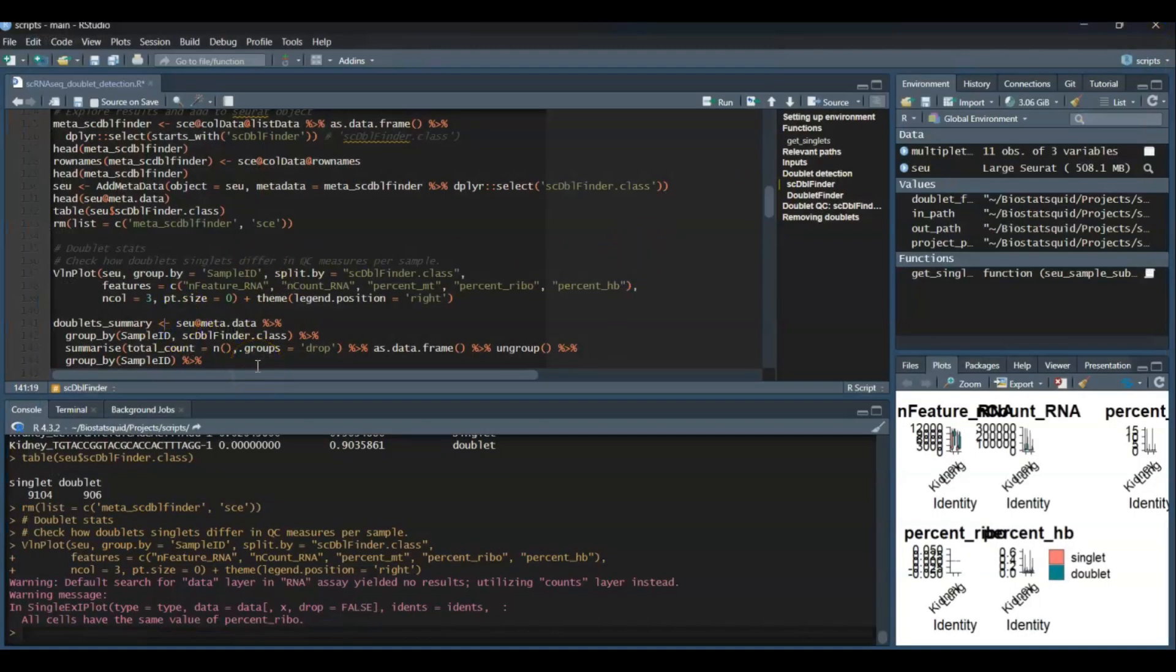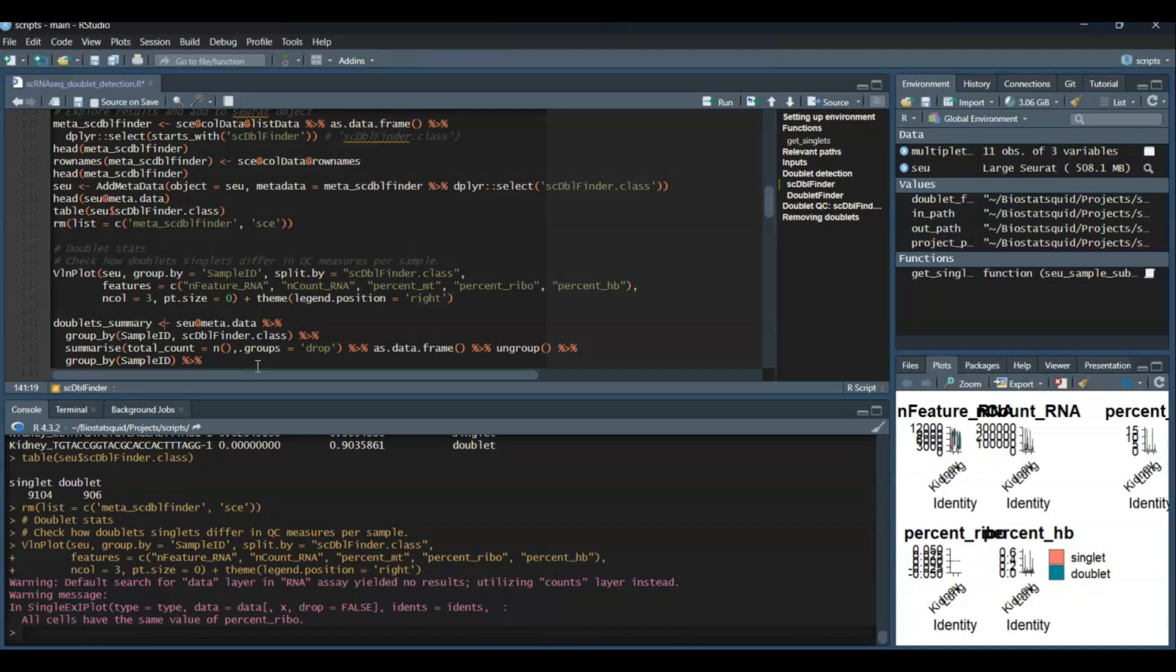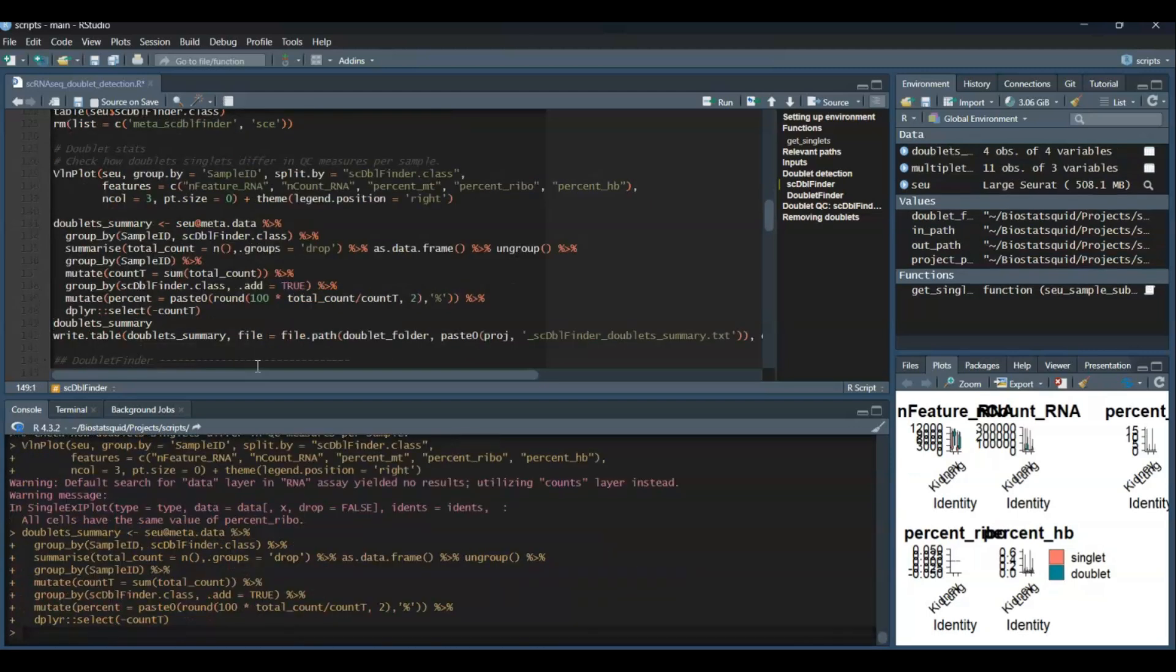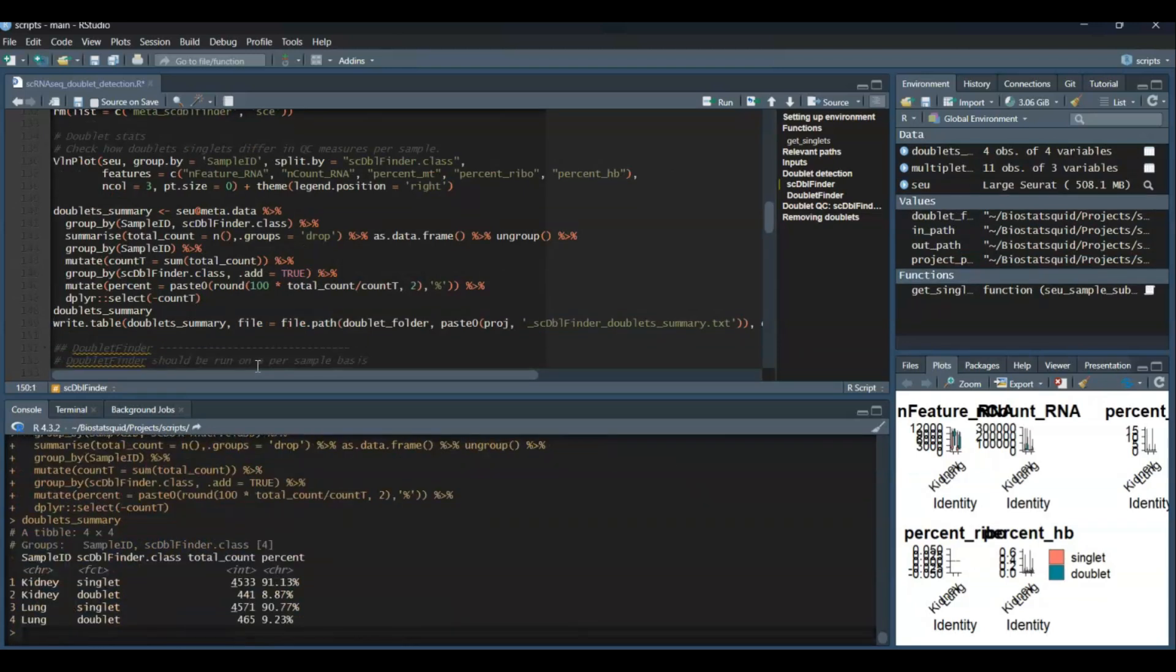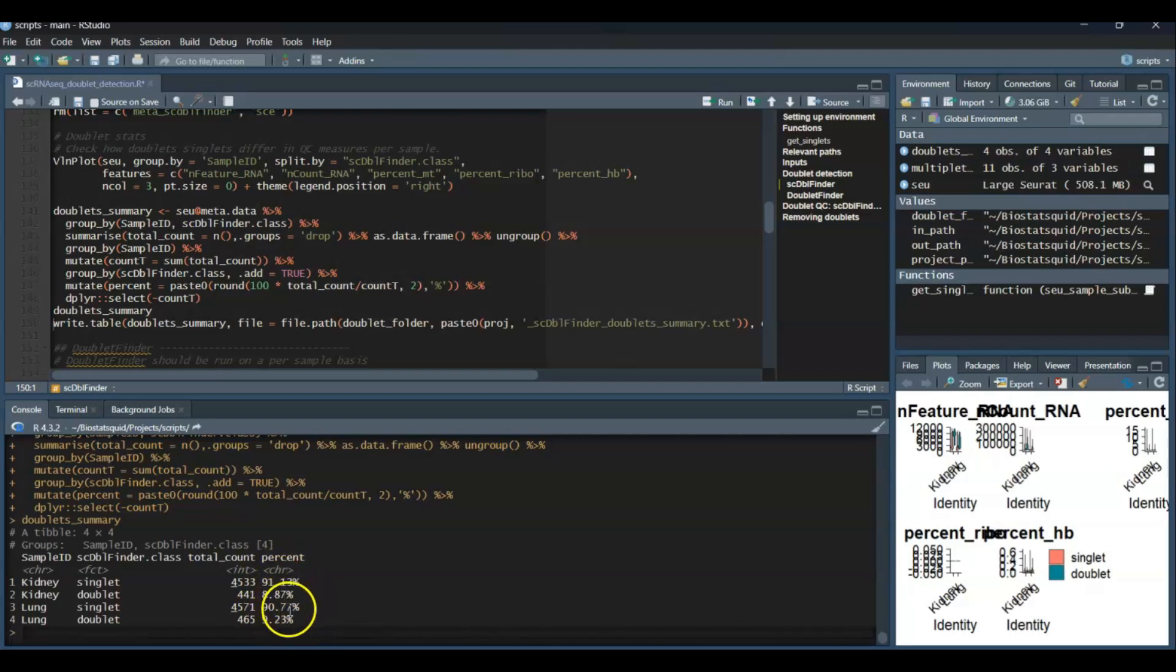Now we can also create a nice summary table by grouping the metadata by sample ID and scDblFinder.class and calculating the total count of cells in each group and the percentage of doublets and singlets for each sample. So that's our doublet summary. As you can see, around 90% of cells were classified as singlets and then around 9% were classified as doublets.